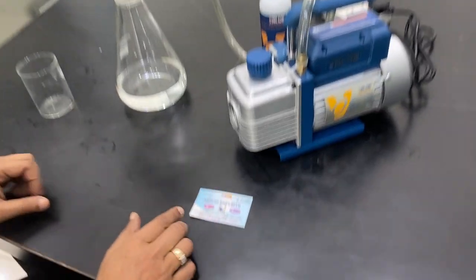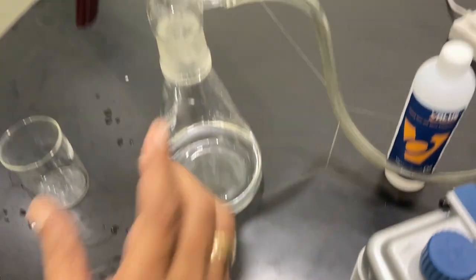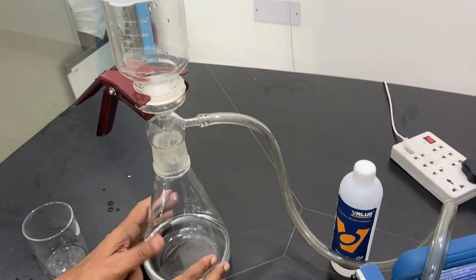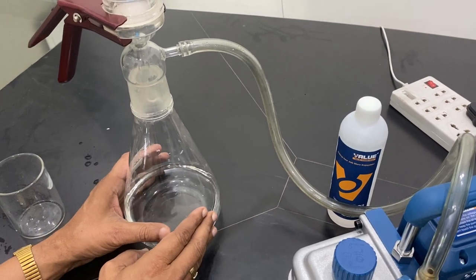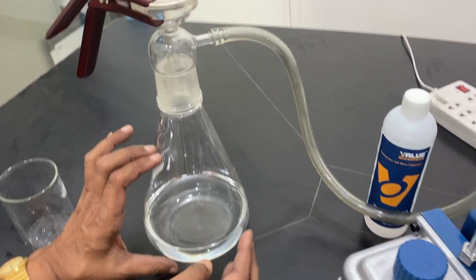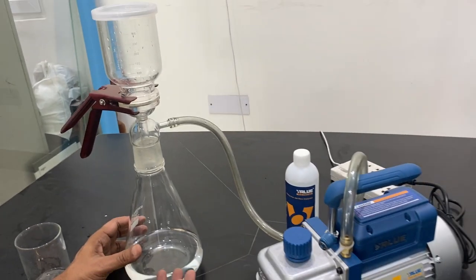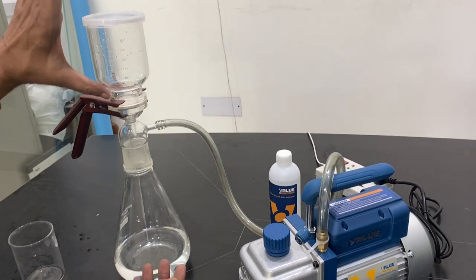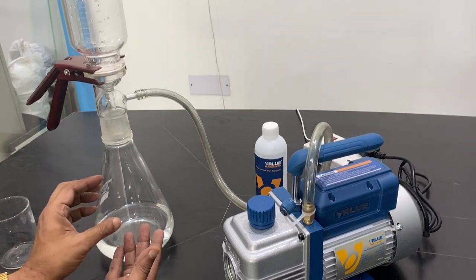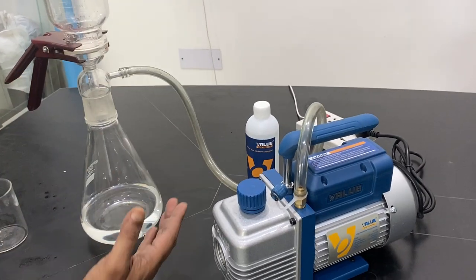Very easy to use. This full apparatus is called mini pour or filtration setup. We have two or three models — one is with a 1000 ml flask, another comes with a 500 ml flask. We also have a 2000 ml flask and a 5000 ml flask for bigger capacities, and smaller capacities with a 250 ml flask, 100 ml, 50 ml, and 60 ml flask.